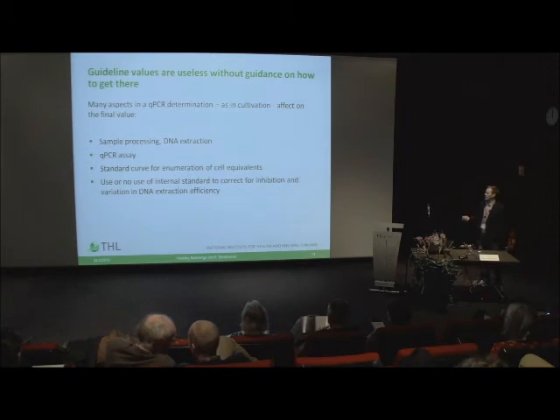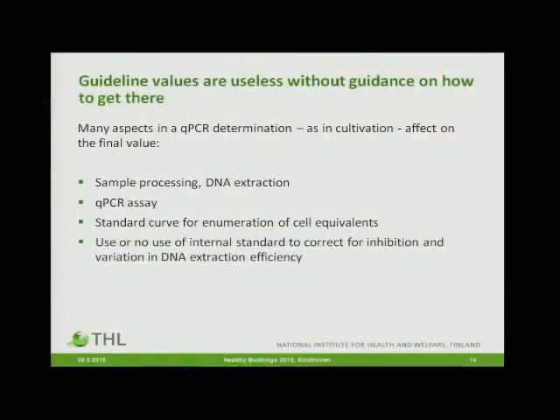Another thing is the use of internal standards. What we're doing is that we add non-microbial DNA of known concentration into a sample before we start the DNA extraction, and then at the end correct for inhibition, for losses in DNA extraction, and so on.